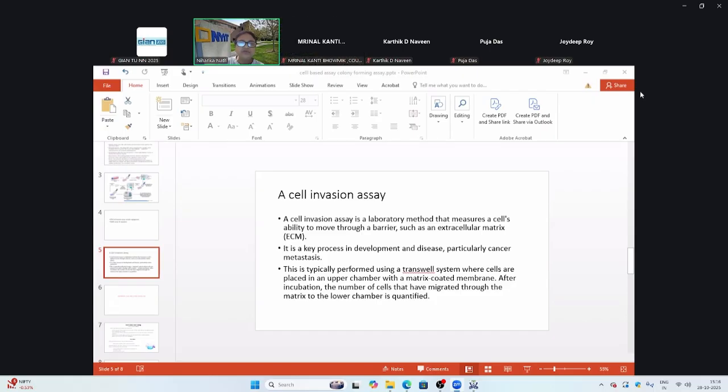I also went to zenodo.org, where there is a collection, and I picked up some of the colorectal cancer images from there. It has about 5,000 images. So if you want to go in and look at them or use them, please do so. I don't think I paid anything, or maybe I did, I can't remember. But it might need some permissions.